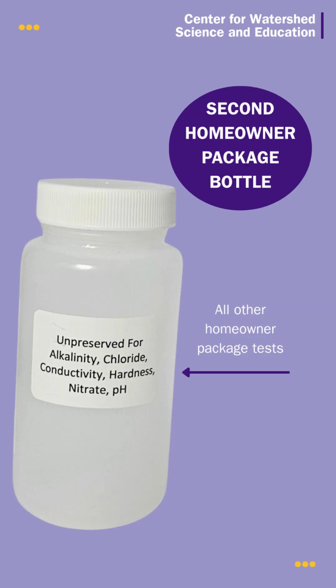The second bottle in the homeowner's package is opaque and small to medium in size. This bottle is labeled with a sticker that says unpreserved for alkalinity, chloride, conductivity, hardness, nitrate, and pH. We will collect the bacteria sample first.